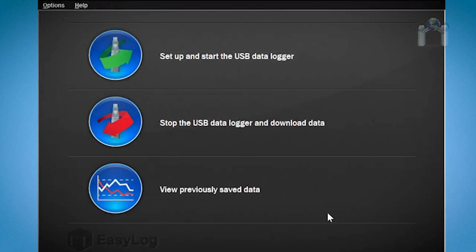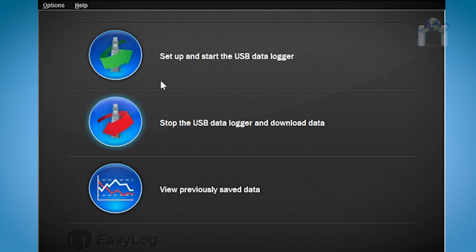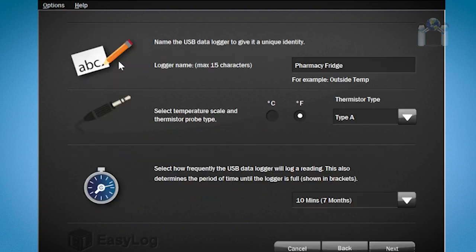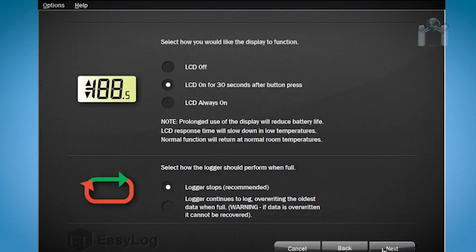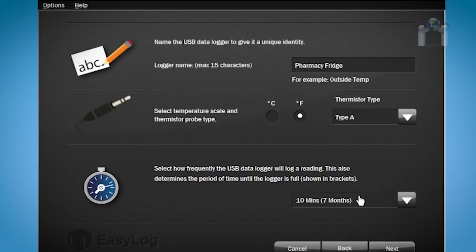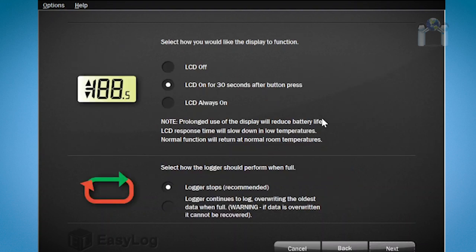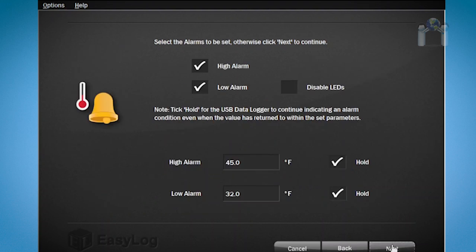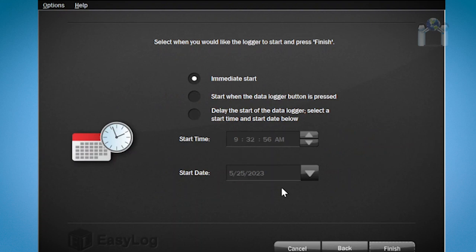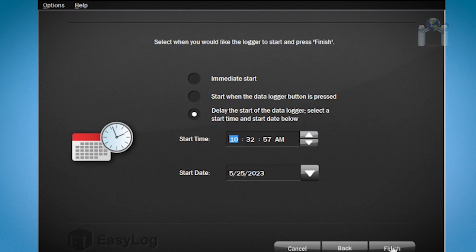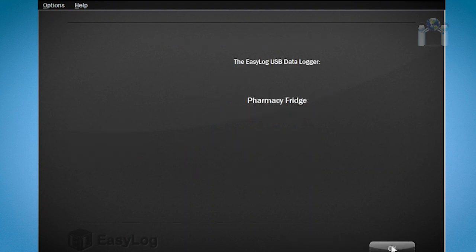After you have downloaded the data from your data logger it will need to be reprimed in order to use it again. Easy enough, just click on setup and start the USB data logger from the main menu and repeat the same procedure at the beginning of the video. You will need to go through the wizard again but all your previous selections will remain. If you have no changes to make simply keep clicking next until you reach the last screen. Again choose when you wish to start reading and then click finish. All set and your data logger is ready for a new reading session.